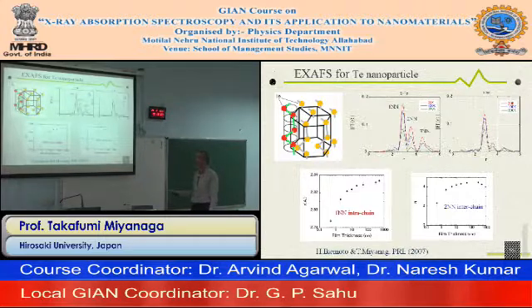Another characteristic structure is the coordination number. This is the intrachain coordination number, and the second nearest neighbor coordination number. The first nearest neighbor is naturally n equal 2, but the interchain has 1, 2, 3, 4 around here. So this coordination number decreases from 4 to 3 or 2. This means the chain structure is conserved, but this three-dimensional stack is broken down.